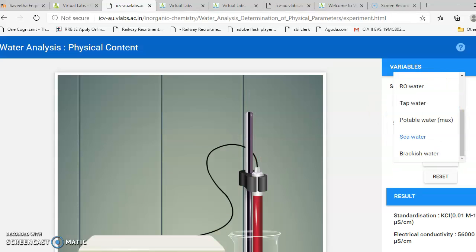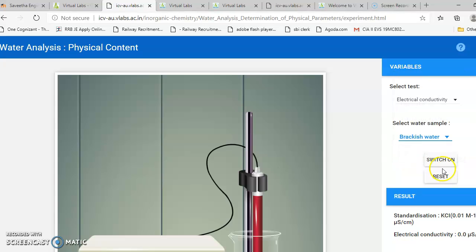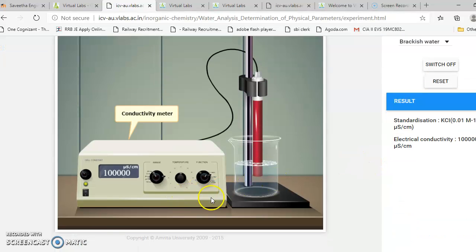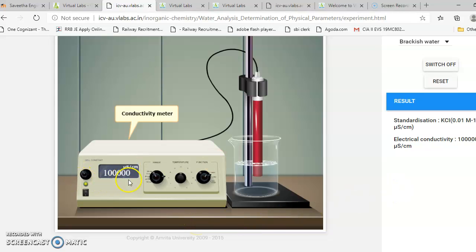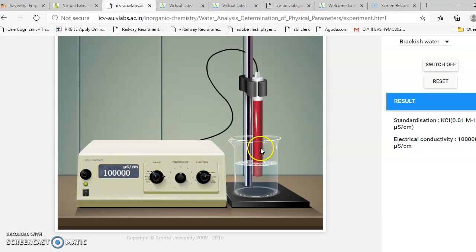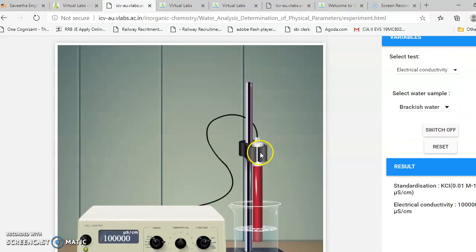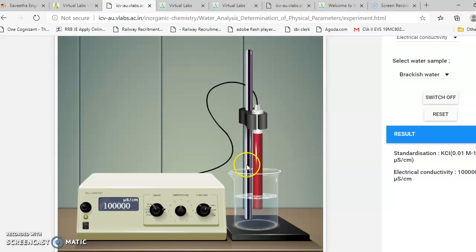Finally, if you choose brackish water and switch on the instrument, it shows about 1 lakh — that is 1,00,000 micro siemens per centimeter. So this is how conductance is measured for different water samples.